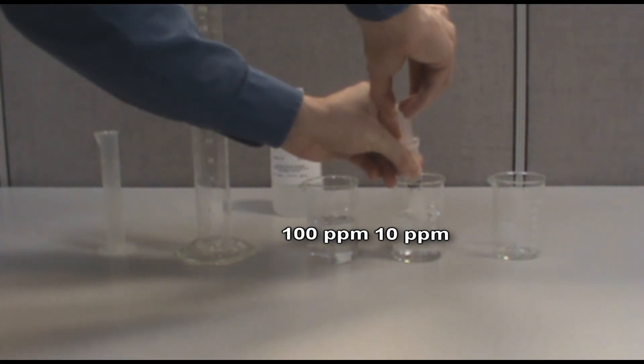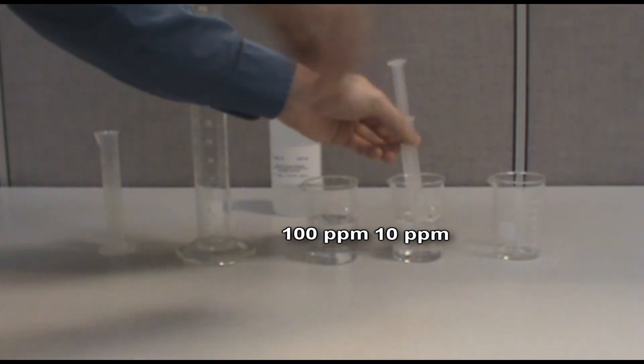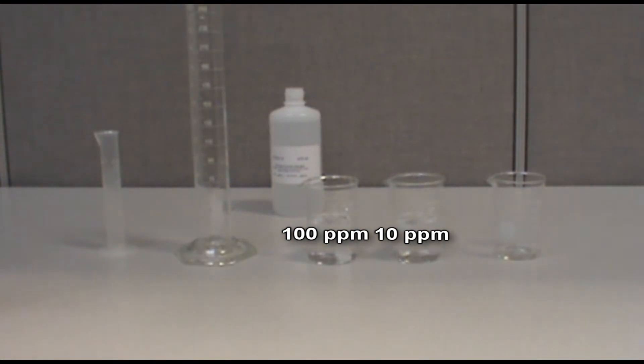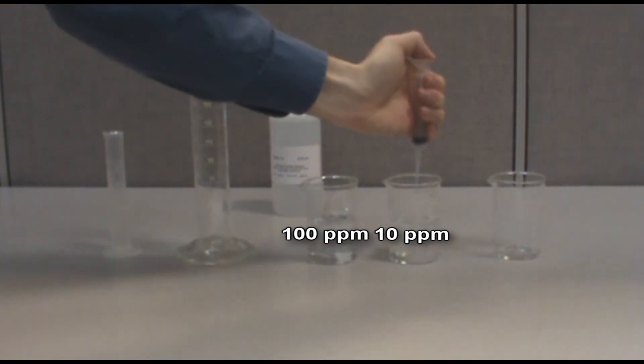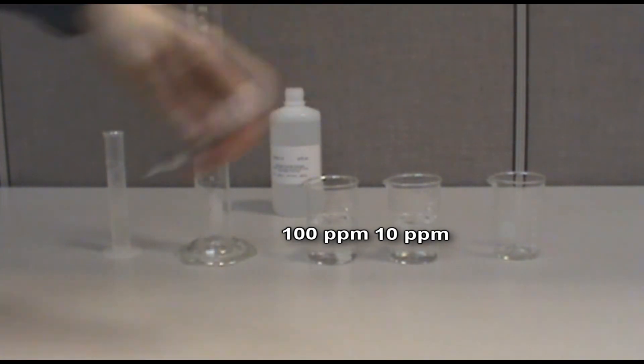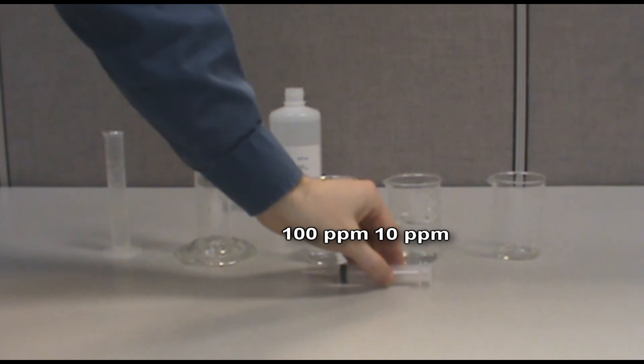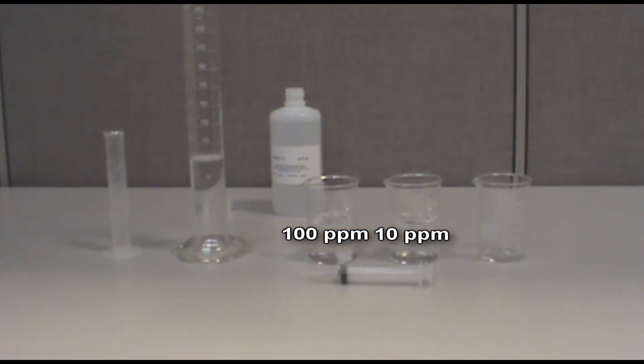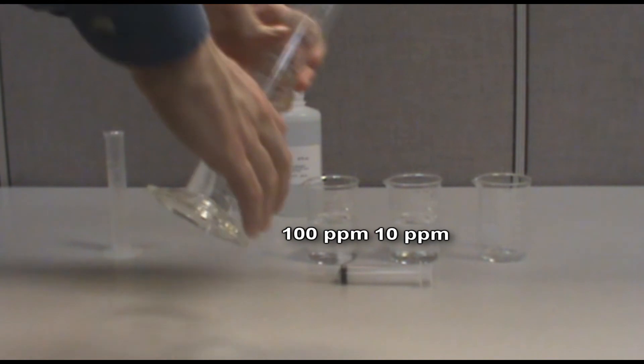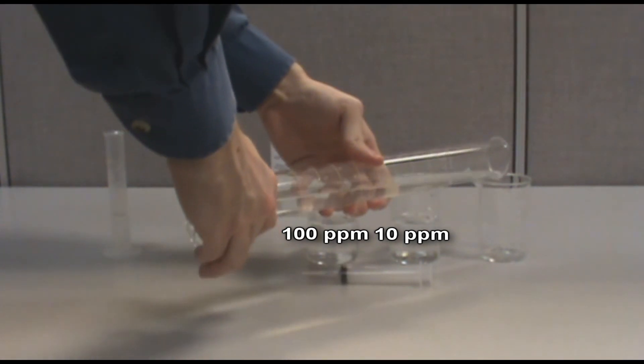Measure out 10 milliliters of your 10 part per million standard using your pipette and graduated cylinder. Then measure out another 90 milliliters of DI water and combine both solutions in your third beaker.